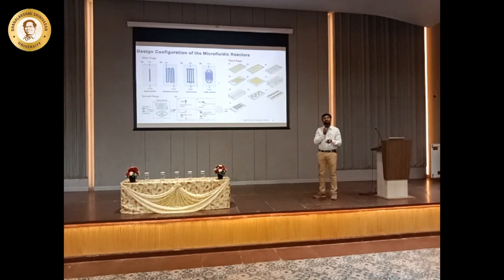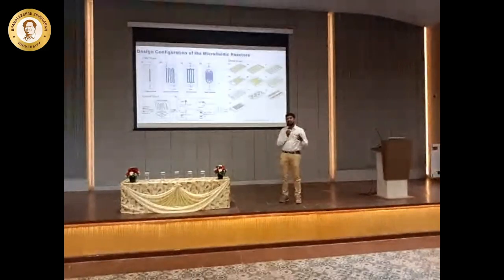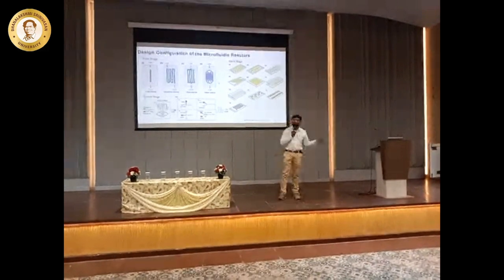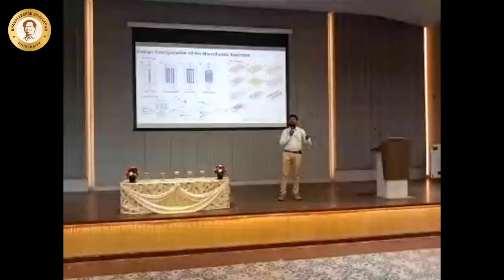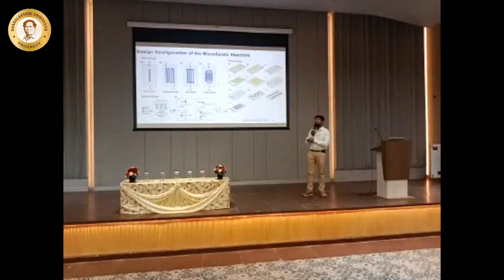So how do you mix it? So for instance, you pour two water in a channel or in a pipe. At the end, it will be the same if it's going to be a straight tube. For instance, you bend the pipe, and then you flow the two liquids into it. At the out, you find a different color. And this mixing will happen only when you have these structures. Because a rapid mixing will take place at these points.